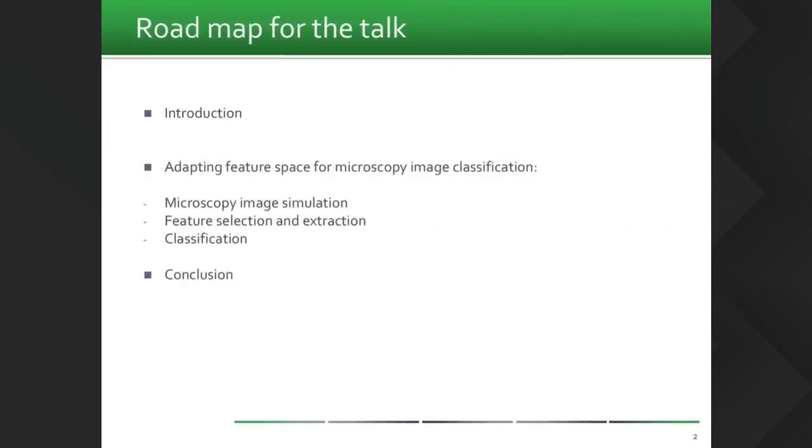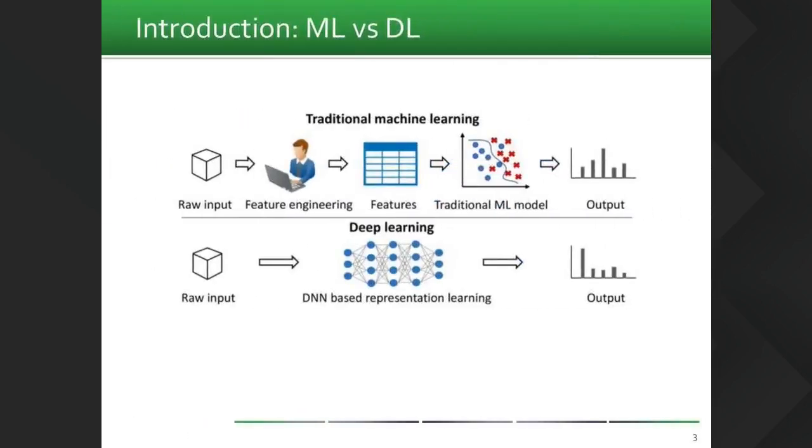During the previous presentation, they introduced machine learning and deep learning very well. Here, during this quick introduction, I will focus on the main difference between machine learning and deep learning. Both are used to resolve problems such as segmentation, detection, or regression, and both are based on the same principle: extract features and train a model.